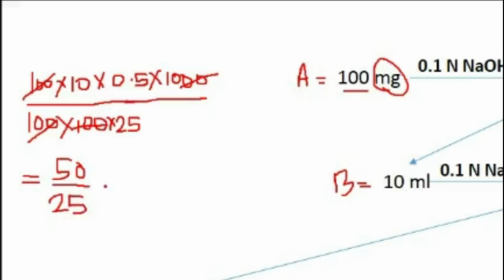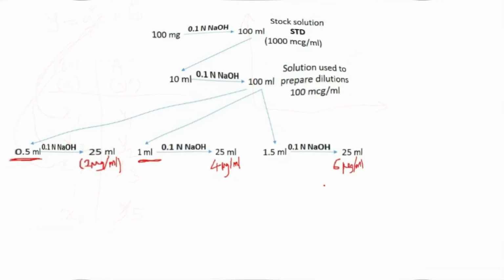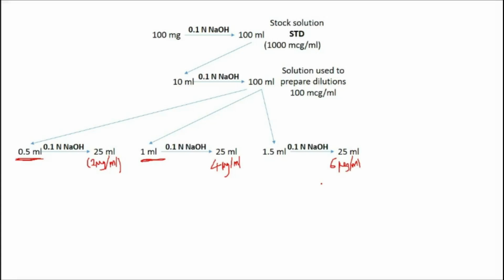अरे बाप रे, अभी कैलकुलेटर लगेगा मेरे को, बहुत डिफिकल्ट है. So it becomes 2 micrograms per ml. आइडियली मैं पहले बताता हूँ आइडियली आपको क्या करना है, और उसके बाद मैं आपको ट्रिक बताता हूँ. हाँ, अभी वो डायलॉग बोलना पड़ेगा, क्रोनोलॉजी को समझिए.